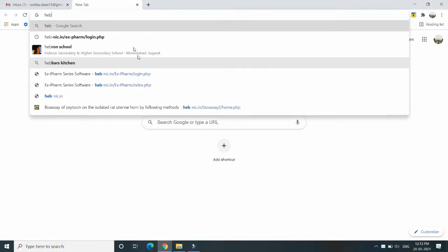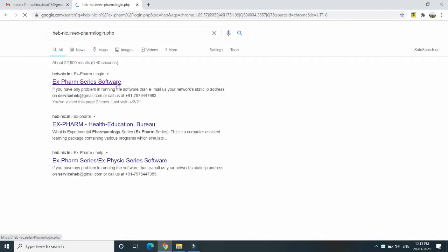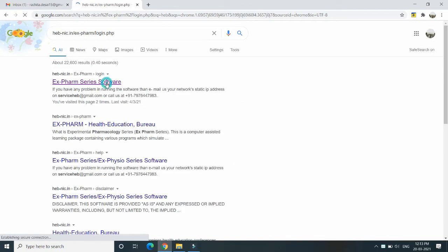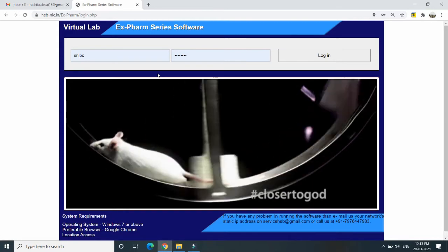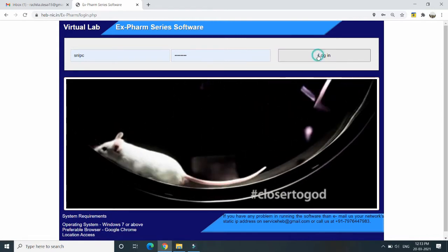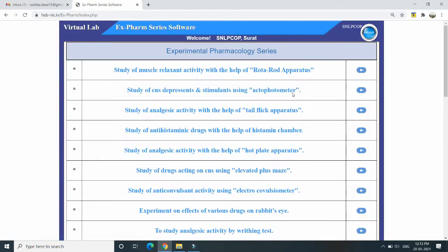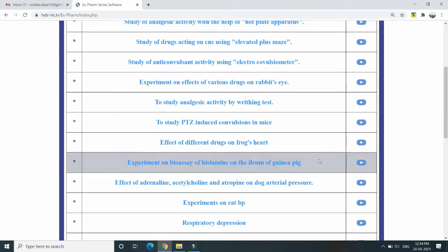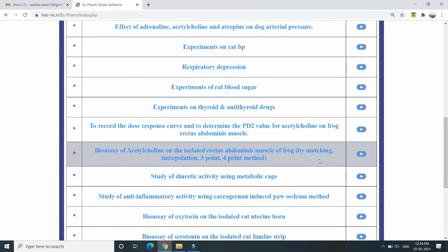First of all we will log in on the site that is heb-nic.in. We have our college user ID and password for this Ex-Pharm software series. As you can see, different screening models as well as bioassay models are also available for virtual demonstration.